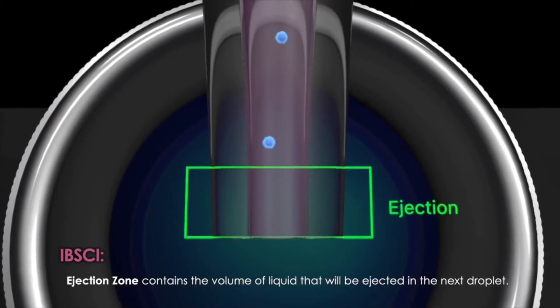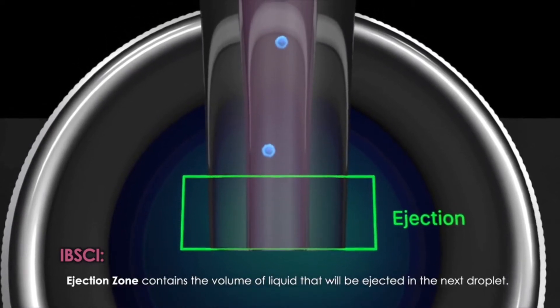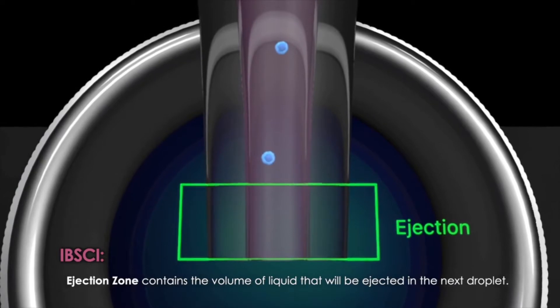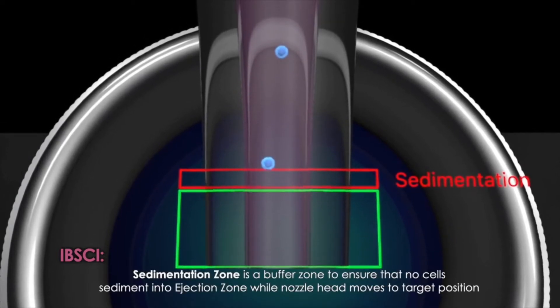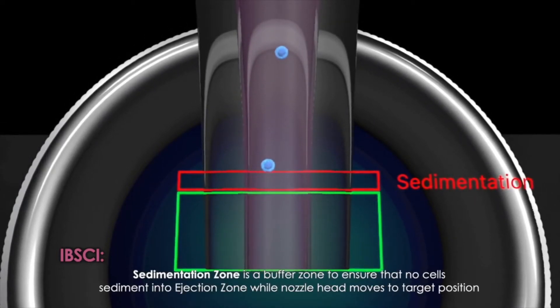On-board algorithms interrogate the contents of the upcoming drop volume for any cells of potential interest. The tip of the nozzle is divided into two functional regions, an ejection region and a sedimentation region.